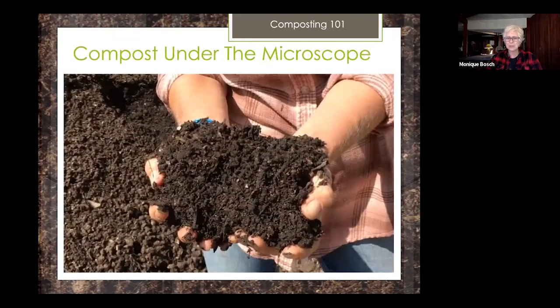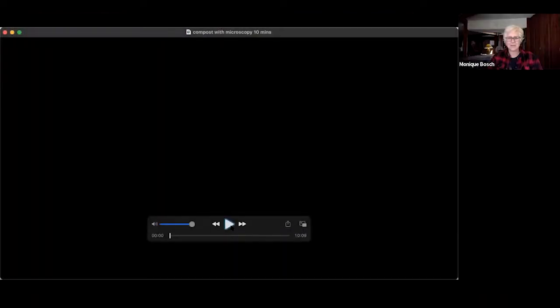All right, so we're going to take a look at compost under the microscope. If I have time for this, and I think I do, a 10-minute video showing compost from various producers and what it looks like under the microscope. So let me go to this video and I'm going to start playing it.